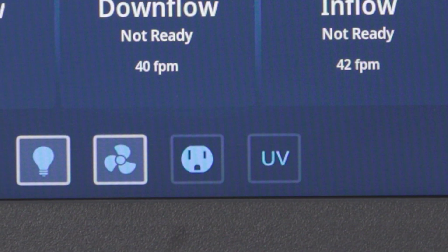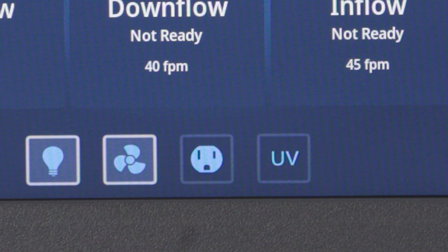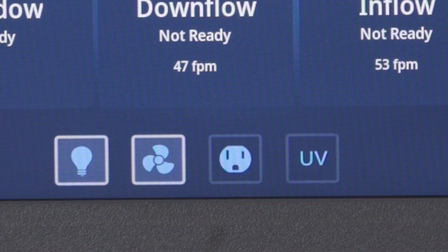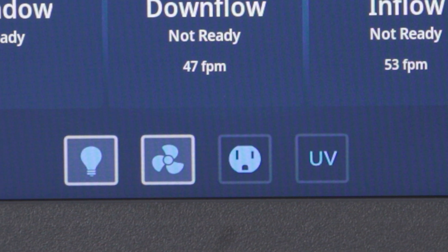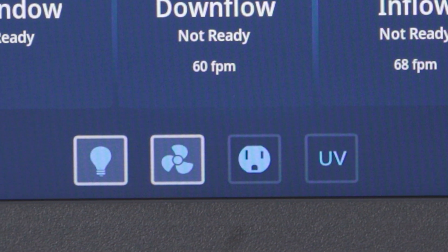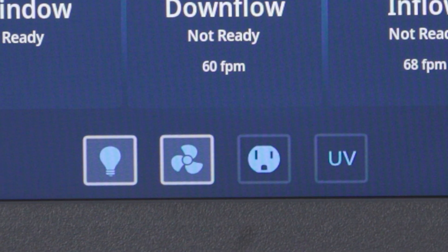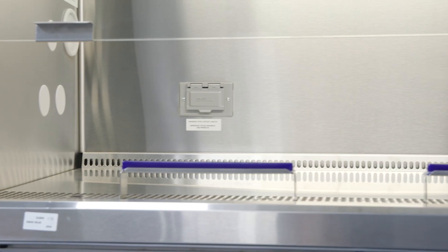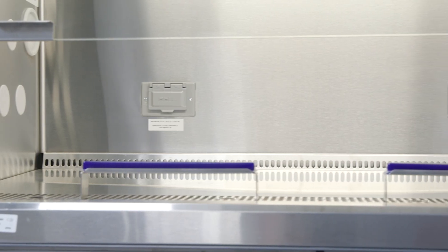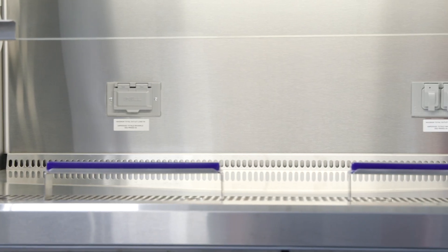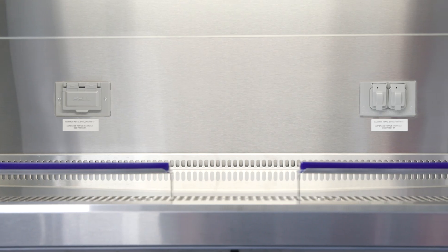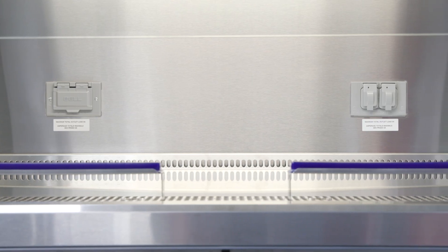Here you'll see the receptacle icon. Remember that the 120-volt cabinet version also includes GFI protection for the internal receptacles. So if you cannot turn on the power from here, it may mean that the GFI has tripped and needs to be reset.